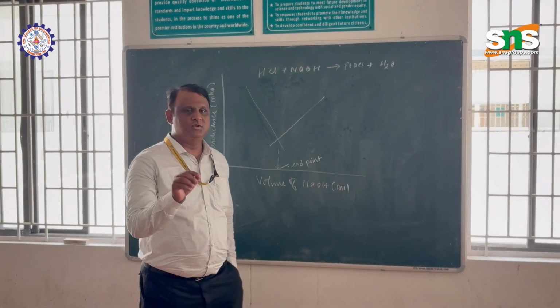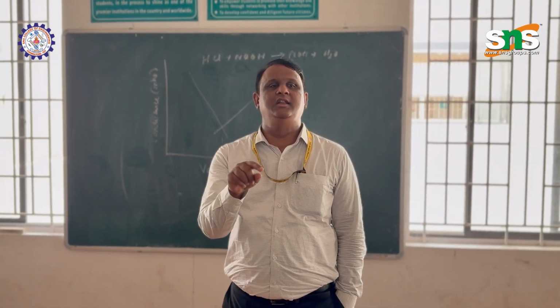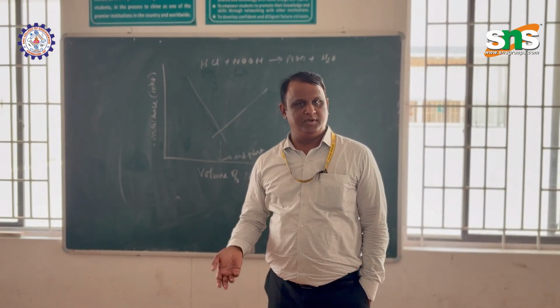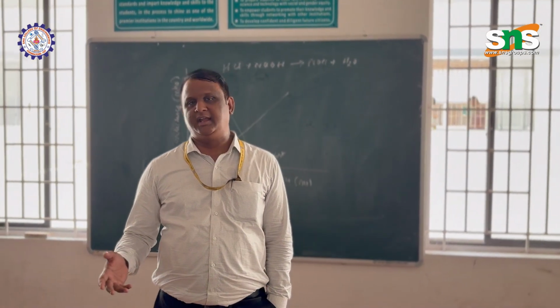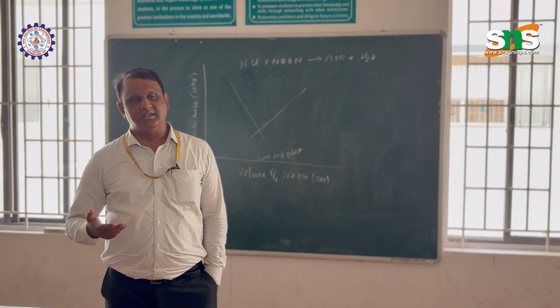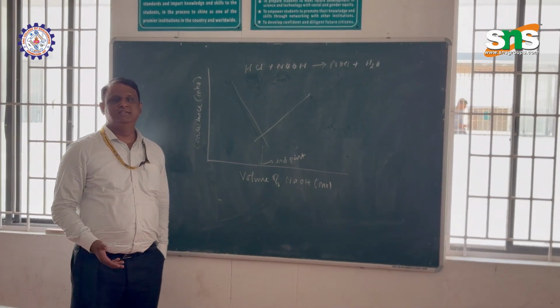Okay, first we discussed why we need conductometric titration instead of volumetric titration. We learned that there are several disadvantages in volumetric titration, and a lot of advantages in conductometric titration. That means it reduces the error. We do it by instrument, and we get the results by graph. How we can do that has been explained by our friends.